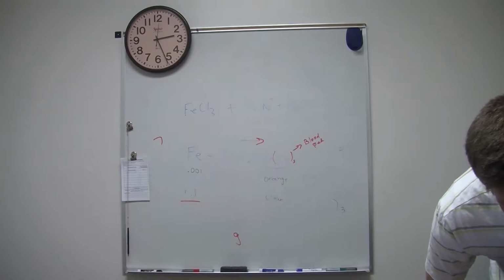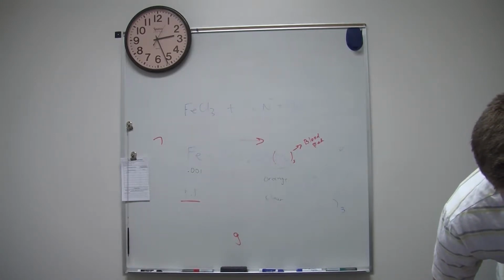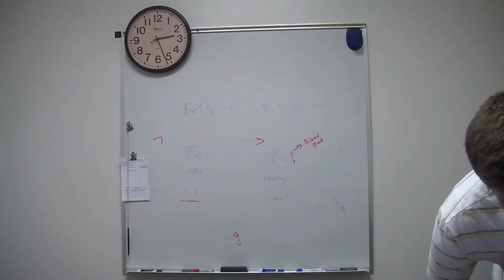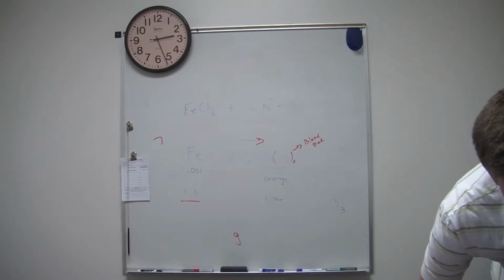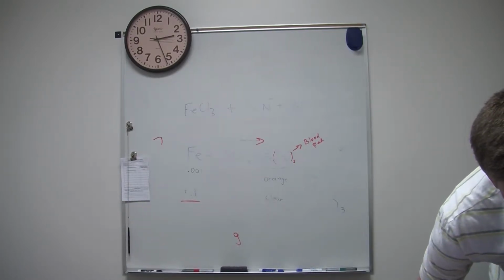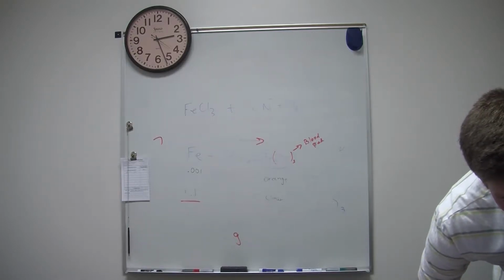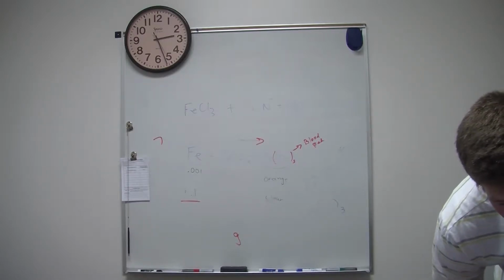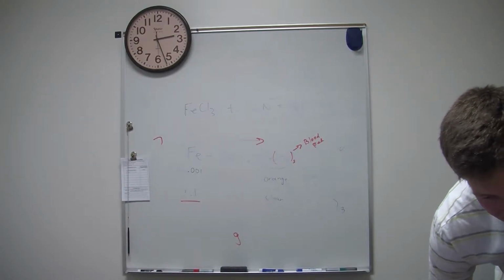We did 4 and then 5 is the next. Now at 5, add 5 milliliters of distilled water to the mixture, explain why any new change in terms of the... Okay. So if you add it, the solution will become dilute enough that the color may be hard to see. I guess I don't explain any new change in terms of the Le Chatelier principle.